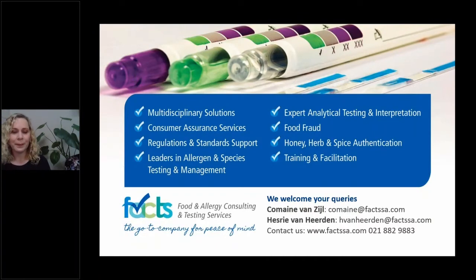Okay, so that's hopefully, Justice, that answers your question. If not, please pop me another one to support that. We've got a question here, and I think you gave us the answer, but let's see whether there's one around. Is there one set of testing kits for all allergens? No. I'm going to hand that one over to Hezri.